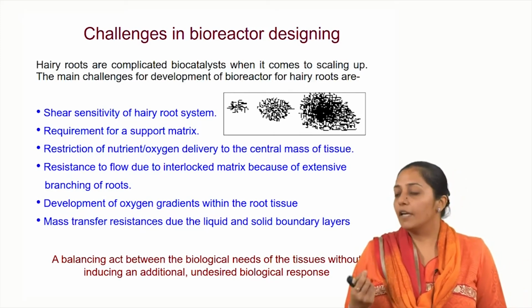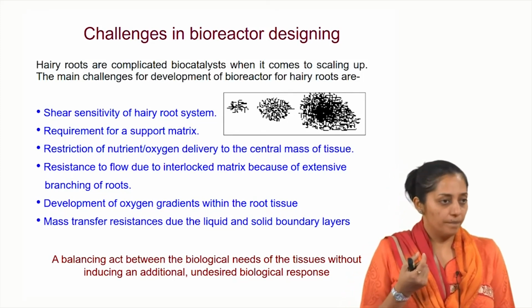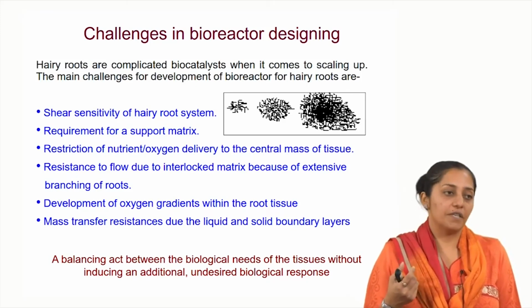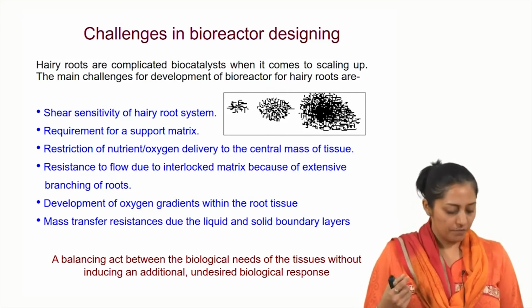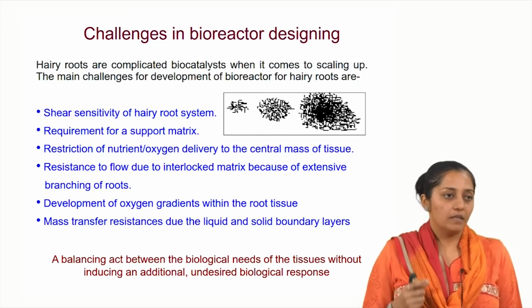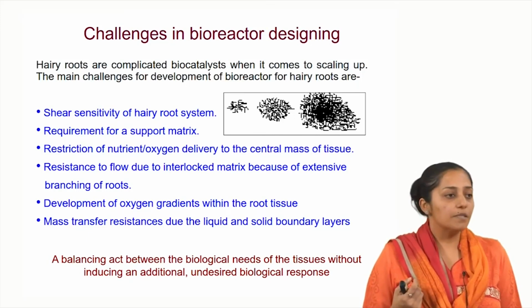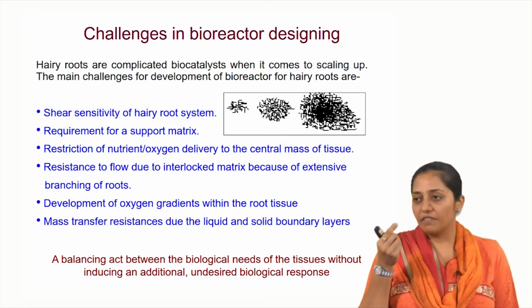And even depending on the species on which you are working, the root itself can be very thick. So if the root is having a thicker morphology, generally for tree species, if you compare with herbaceous species, herbs will look like this. Generally if you work with herbs, then you will have very fine roots, but if you are working with tree species, then you may have very brittle morphology and thick morphology.